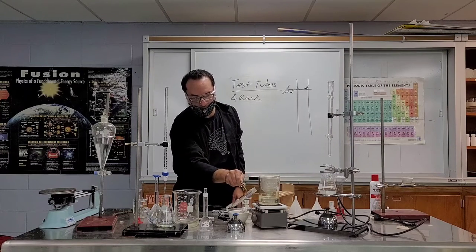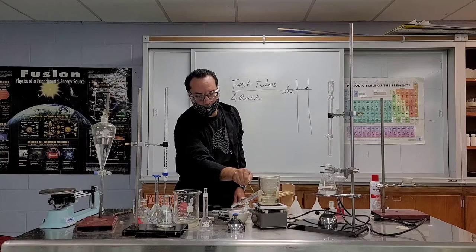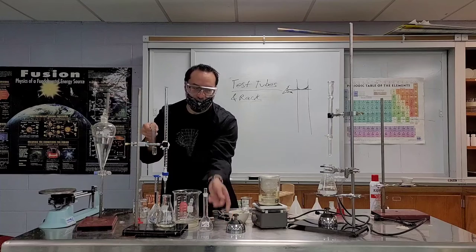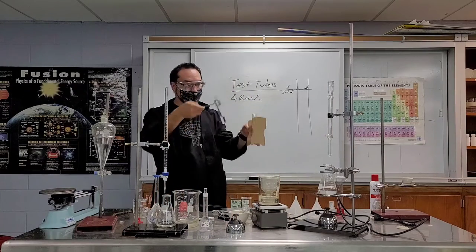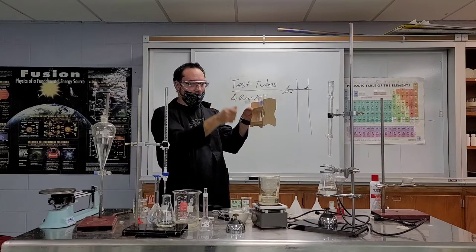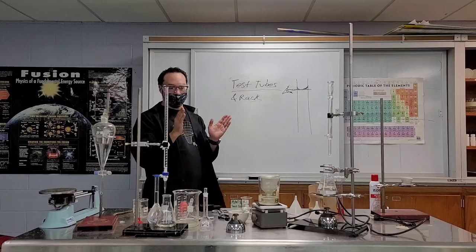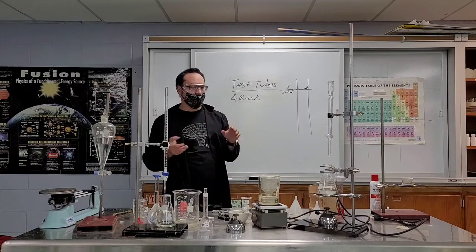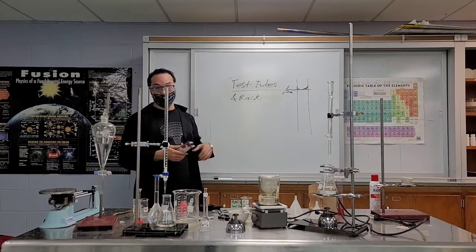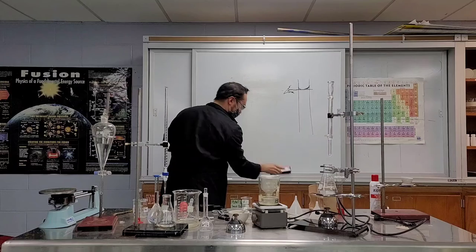I'm already seeing some water and steam hop, about to hop out. Oh look, see, there was already, I'll show you, there's stuff flying out already. And even if it's just hot water, it doesn't matter if it's not an acid. Hot water can seriously injure you. Oh, by the way, the racks are made of wood, so you can basically put a hot test tube in there and not going to cause any damage. So test tubes are for watching chemical reactions and heating, and maybe sometimes cooling things off, and watching what happens to the substance. That's it. Mixing chemicals, watching reactions, and heating things. Not measuring or anything.